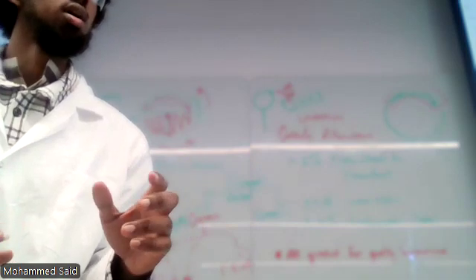Where do you place it? I'm going to place it in the incubator. In the meantime, when your bench is done, tape them up, and that'll make it easier. You can just put a label for your group down there, right beside the ethanol. You could just say your group's label with the practical number, and then if you could add in exercise 1, that way they're separated. Thank you.